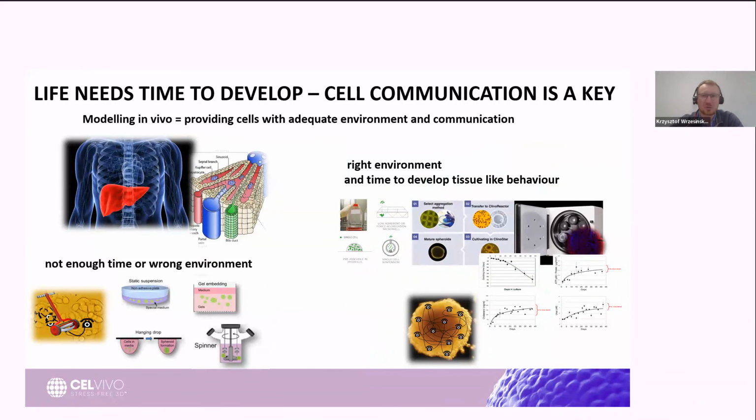Besides proper nutrient delivery and spatial localization of our cells, adequate time is needed to develop properly physiologically relevant models with the right cellular communication and functionality. Unfortunately, many tools we have been using had several limitations in this aspect. And those limitations triggered us to develop new methods which improve our models and place them closer to a physiological in vitro situation.